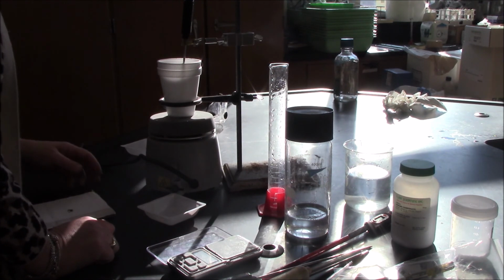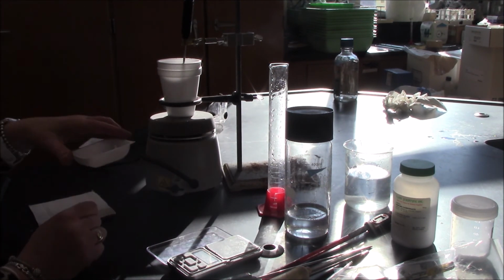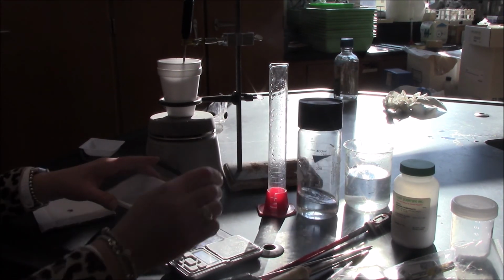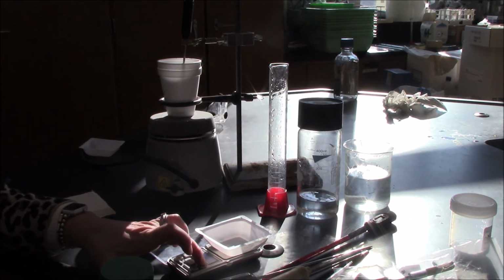I'm going to give it a moment to equilibrate. While I give it a moment to equilibrate, I'm going to measure out a mass of about 5 grams of my ionic compound, sodium carbonate.